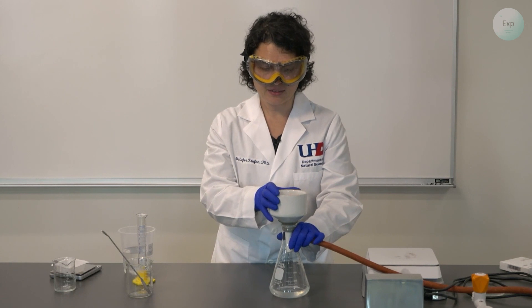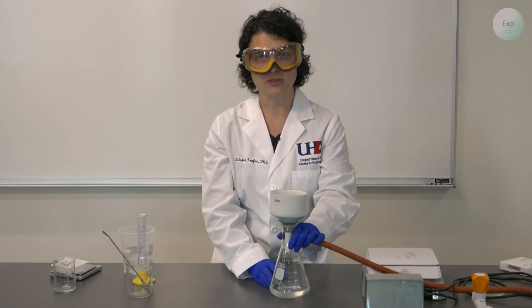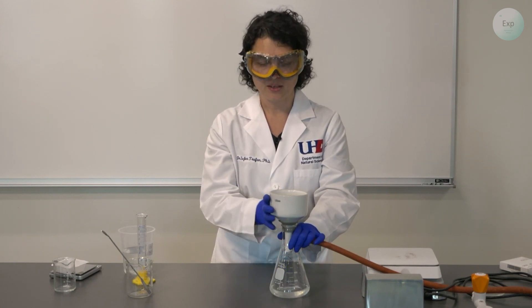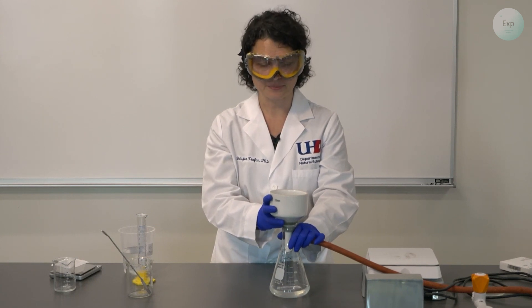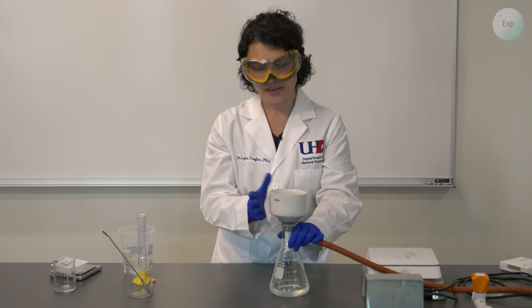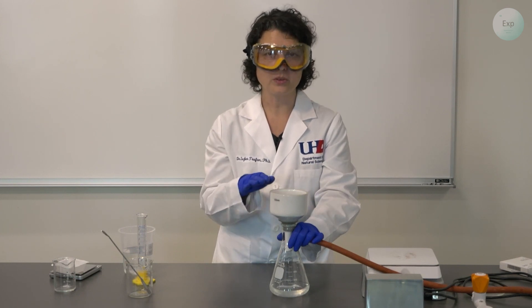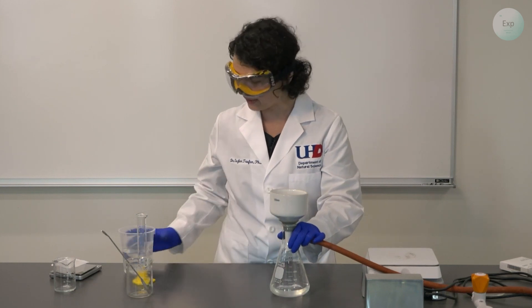For the rest of the time, we need to wait until all the solution goes through — the water with the dissolved soluble salts. On top of the filter paper, we should collect only the calcium carbonate. To complete the experiment, we need to rinse at least once or twice with deionized water to remove all the soluble impurities from our calcium carbonate solid on top.